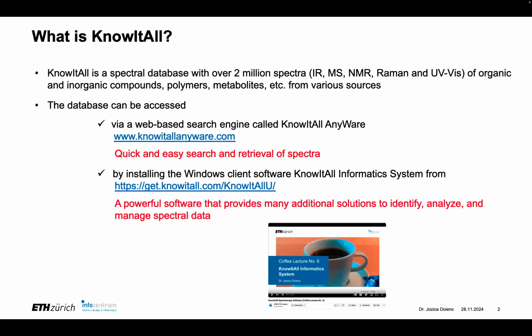The other way is to install the Windows client software, KnowItAll Informatics System. This is a software by the same company, which is a professional software, and it allows a lot of analytics on spectra, also database building. It has lots of solutions.